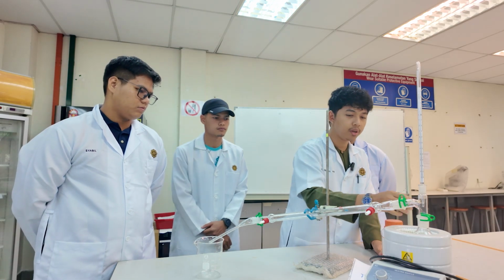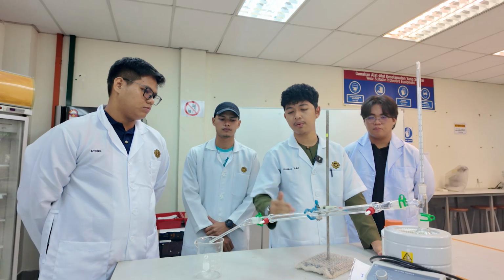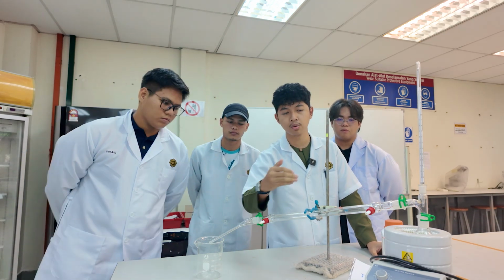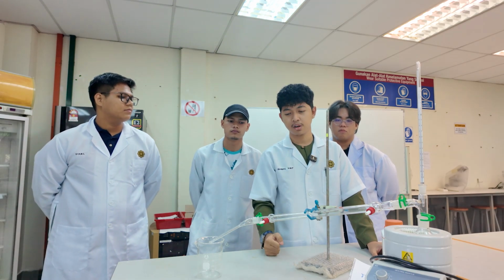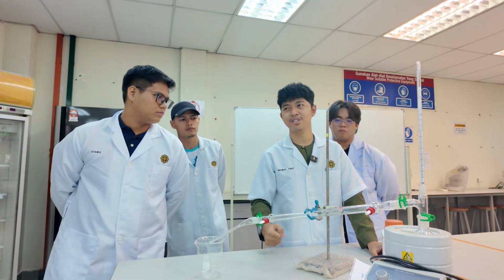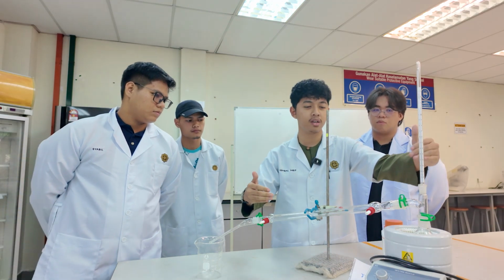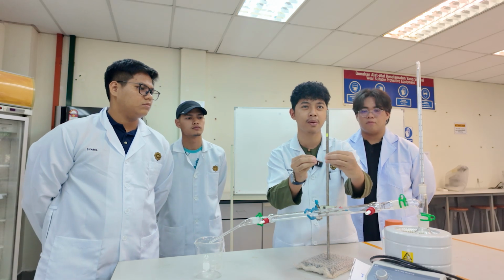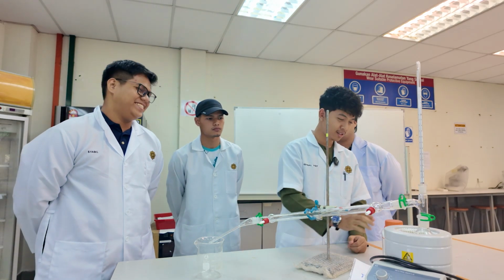When we heat it, we need to let the water flow, and the water will flow from the bottom to the top, because we need to achieve efficient cooling. How do we achieve the efficient cooling? When the water flows, the gas will come from here. So let's say the coolest water meets the hottest vapor. So, boom, cool.